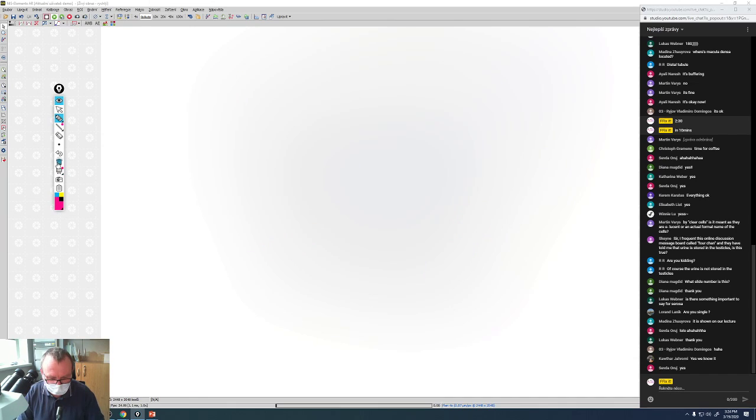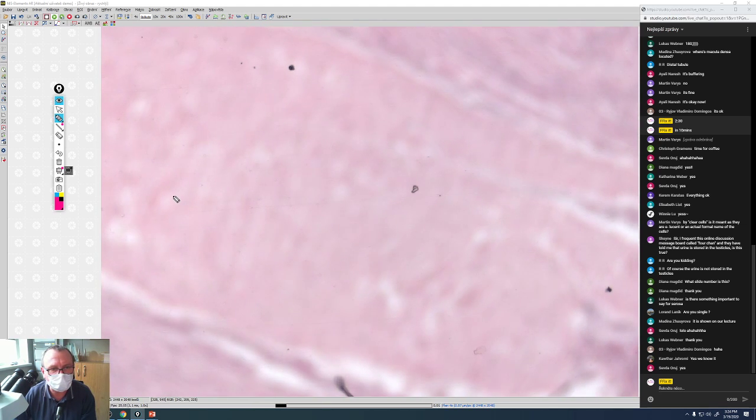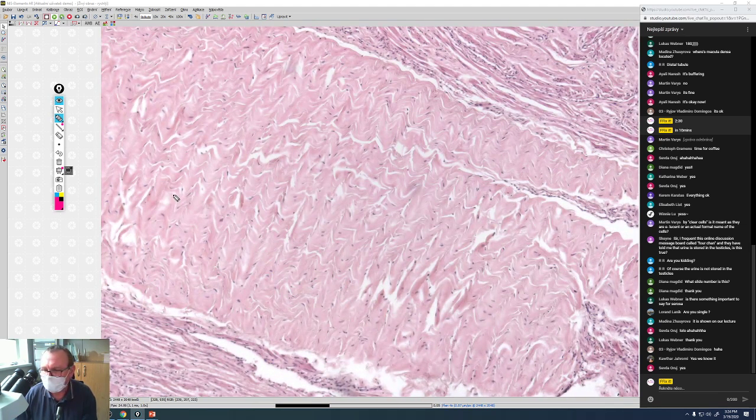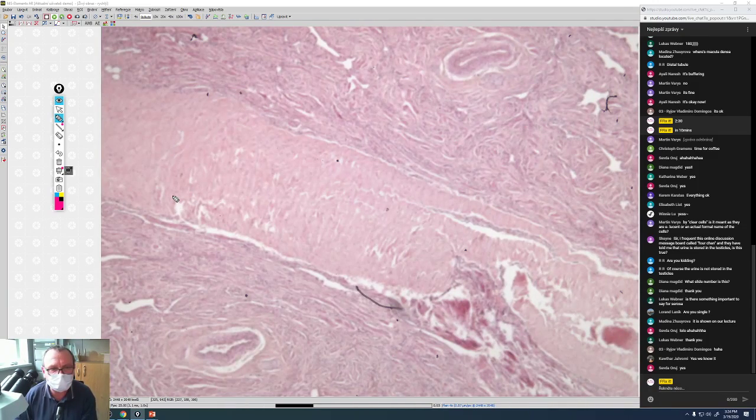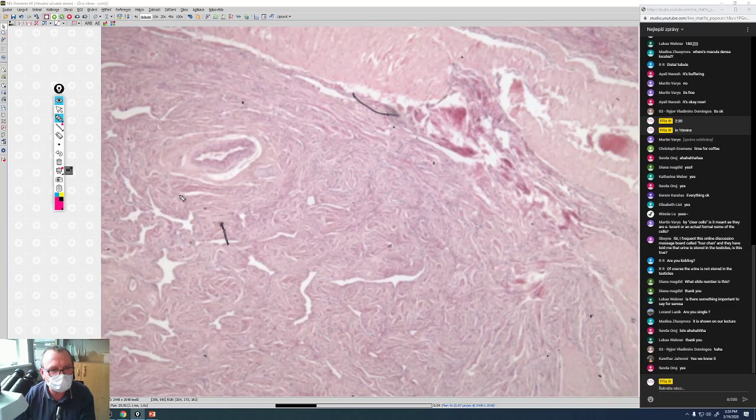And as Andrea already described, it is possible to find other sections of the penis in our boxes, which are made through the terminal part of the penis, through the glans penis. And again, I'll try to find only the urethra at this moment.